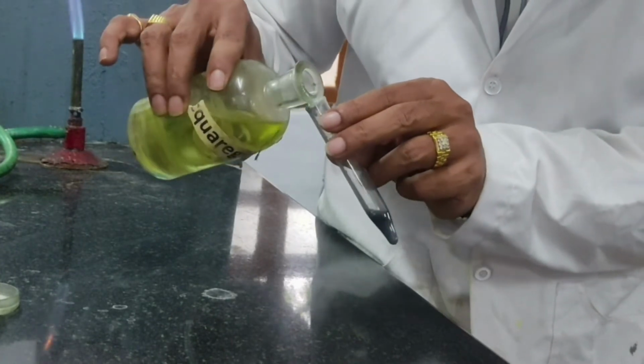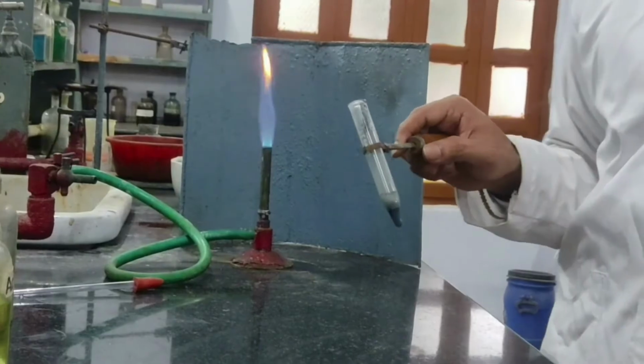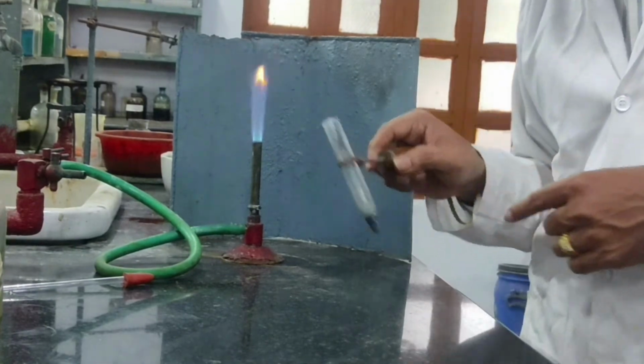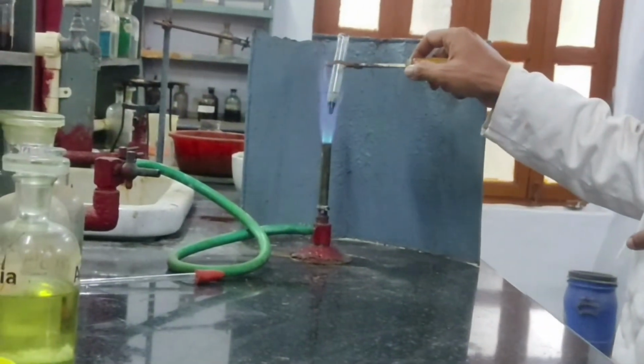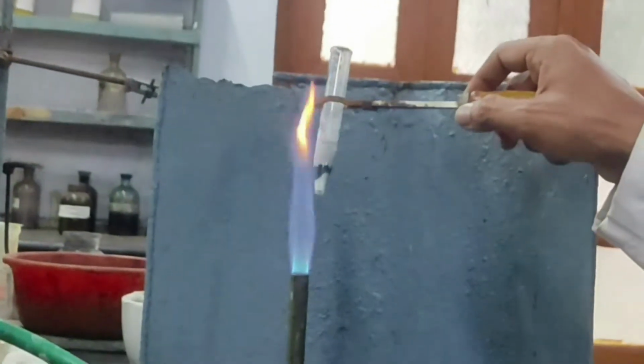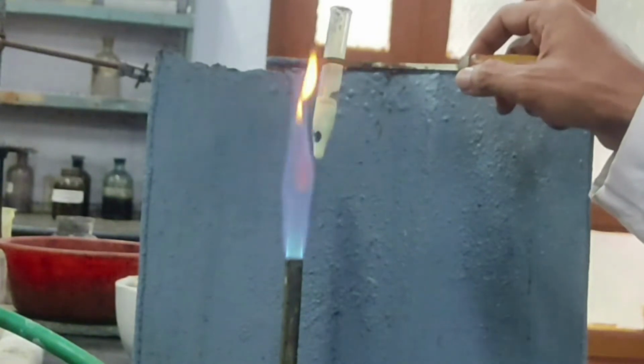Don't add too much, a few drops are sufficient. So I have added aqua regia to the residue and now I am heating this. Slowly heat until the total precipitate gets dissolved.